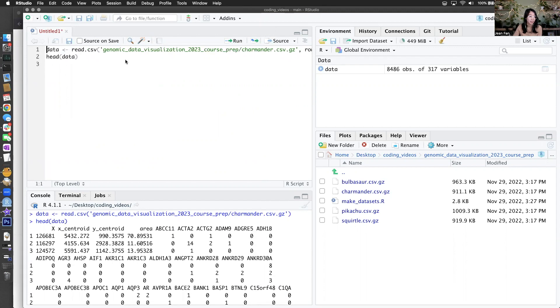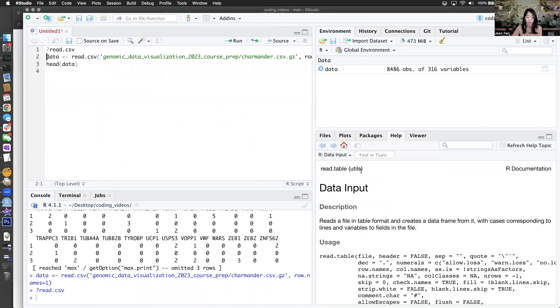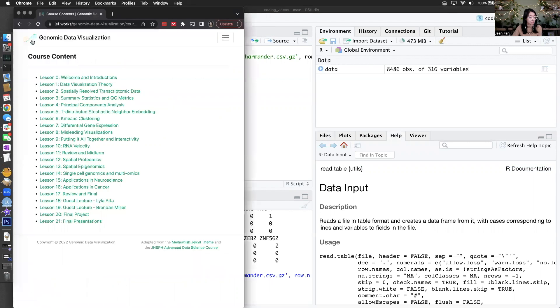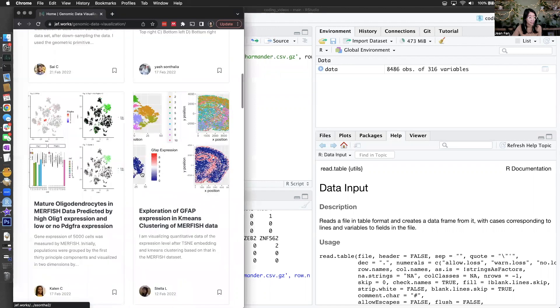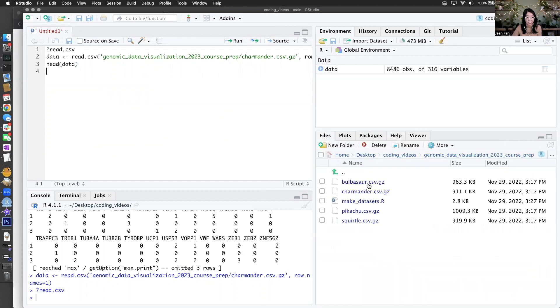I want to first read in the data — this is part of the utils package, which I think should be installed by default. Last year the students worked on a couple different data sets of mostly brain. So this year, switching it up a little to change up the data set, and also making one data set cut into four different parts so that students can form teams and work together to analyze these different data sets that are technically of the same tissue, and hopefully they'll come up with similar answers as to what this data is.